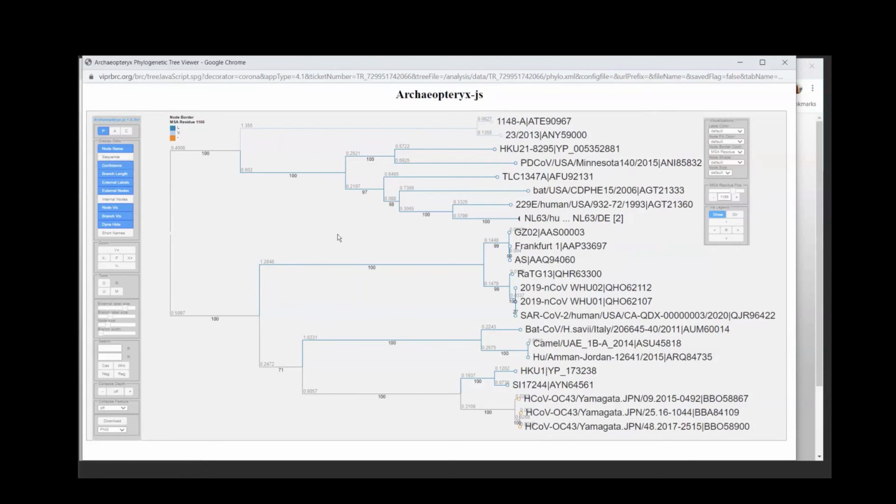You see here we have mostly 100, so that would be very reliable. I would say anything above 90 is very reliable, and anything below 50 is not reliable. But then the area between 50 and 90, to be honest, I don't know, and I don't think anybody really knows. It probably mostly depends, if you're publishing something, on what the reviewer thinks is good enough.